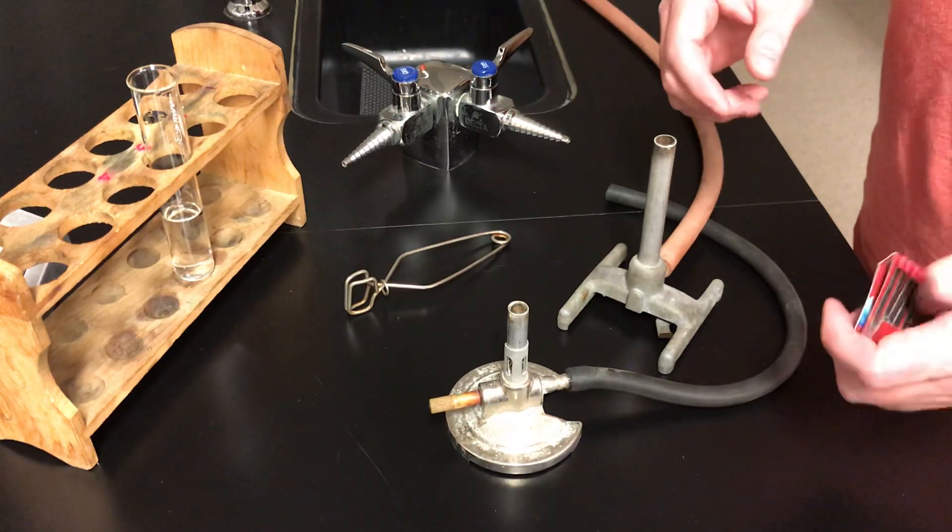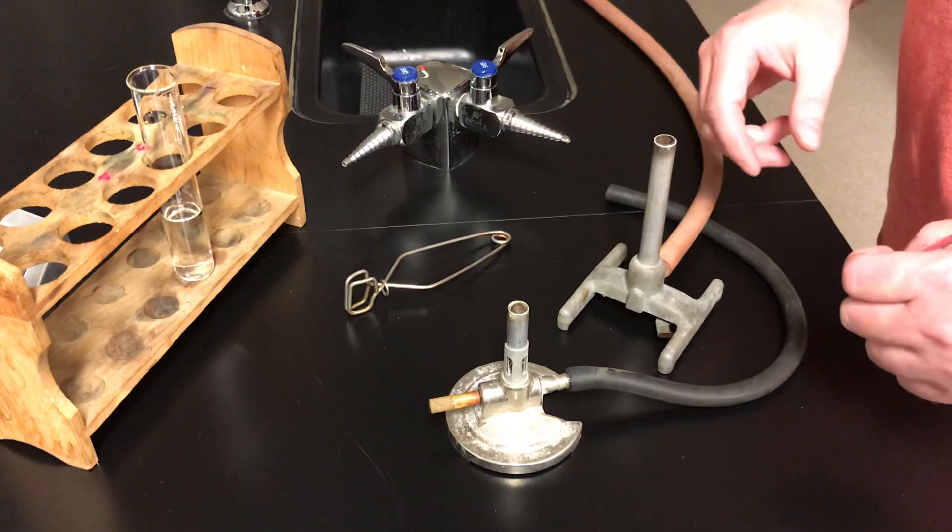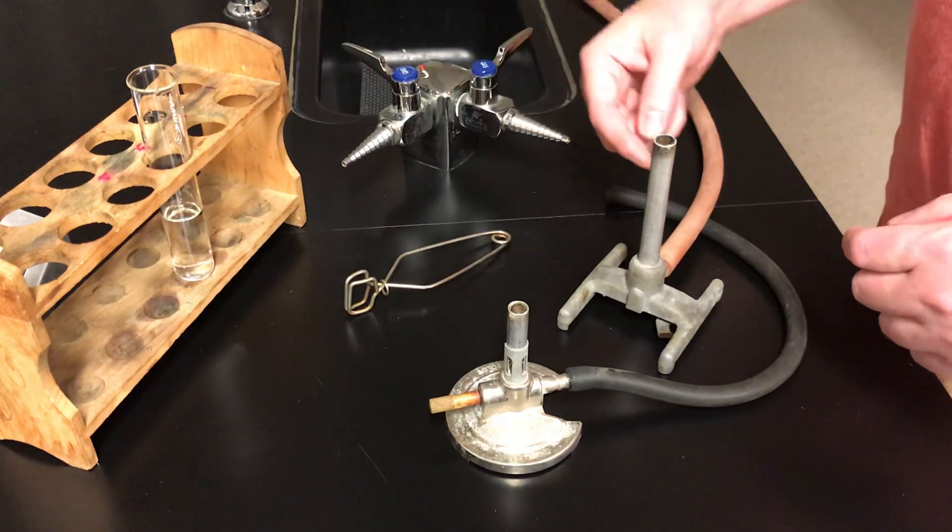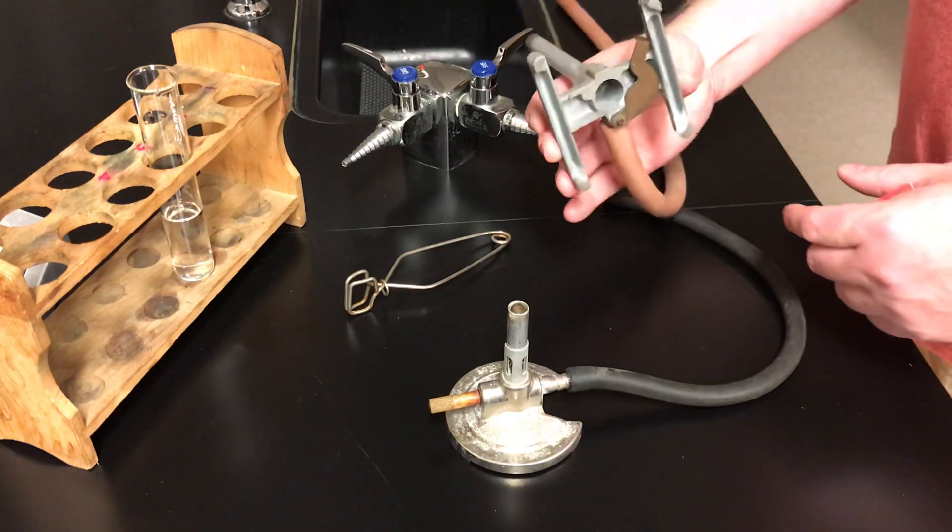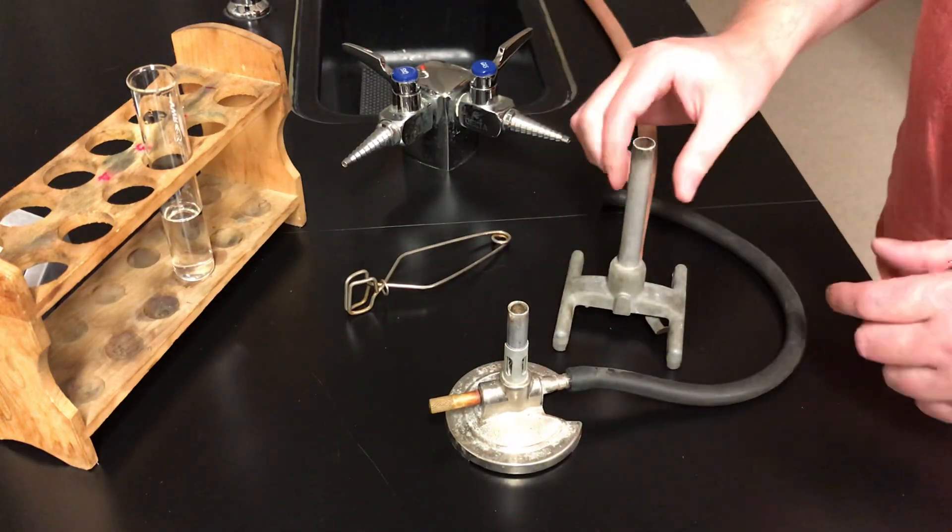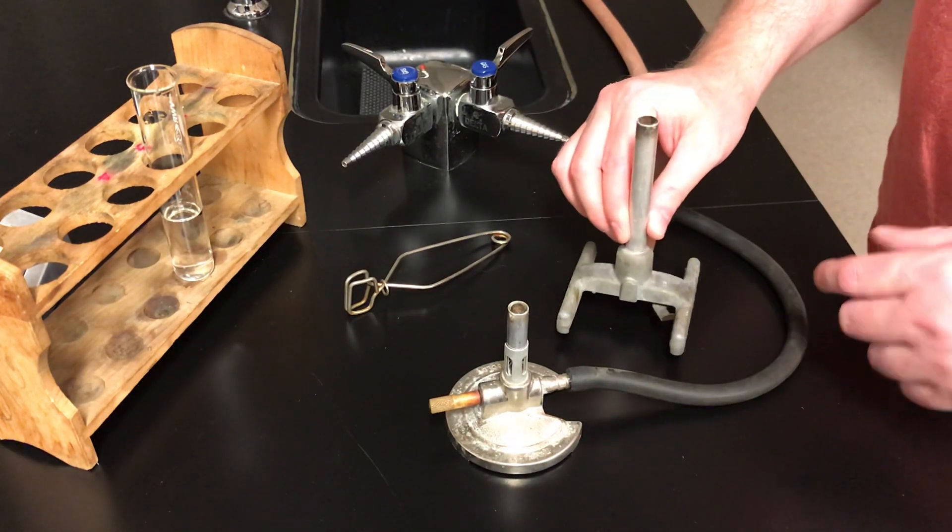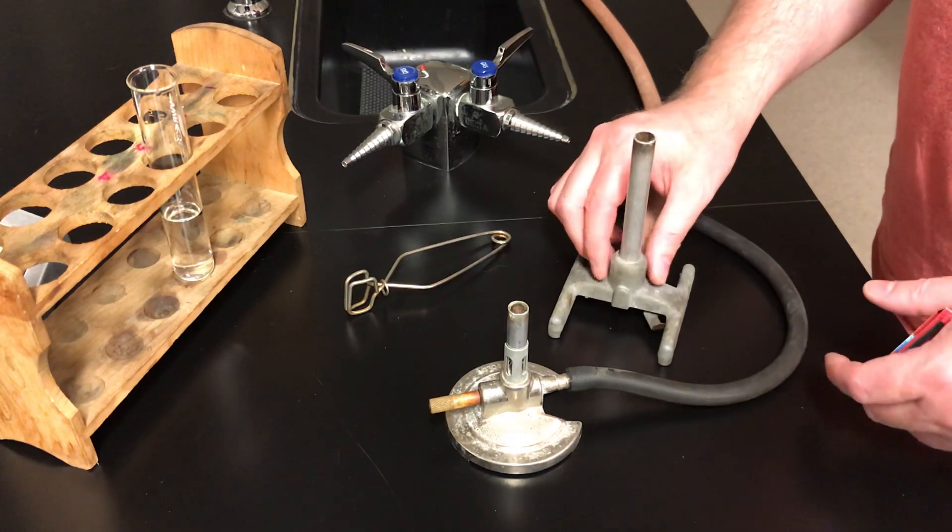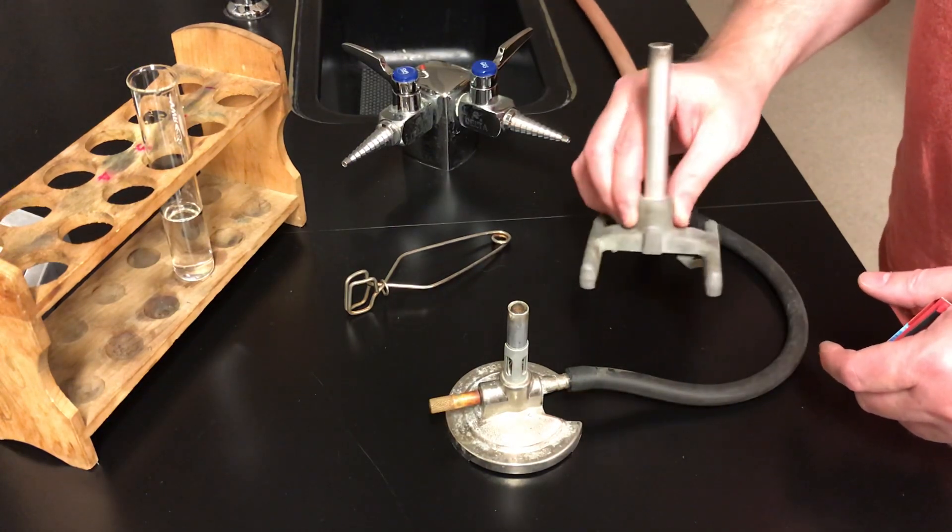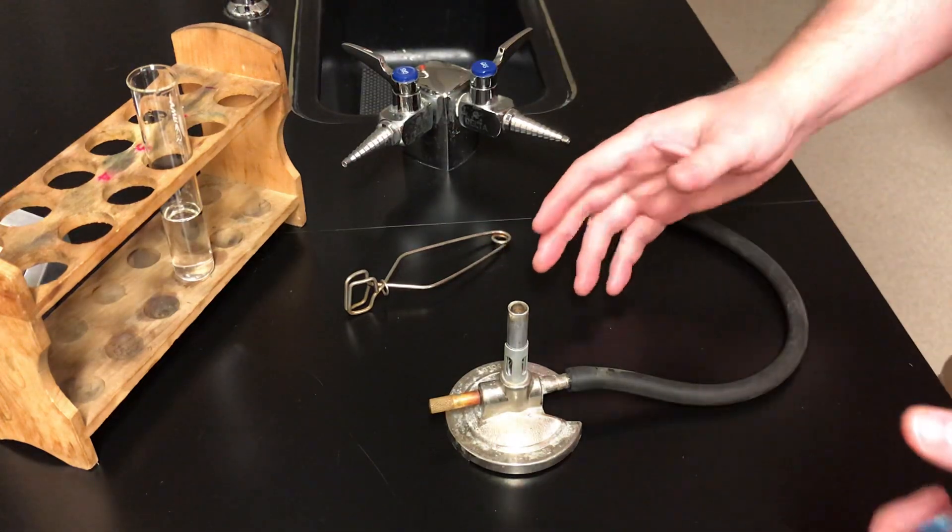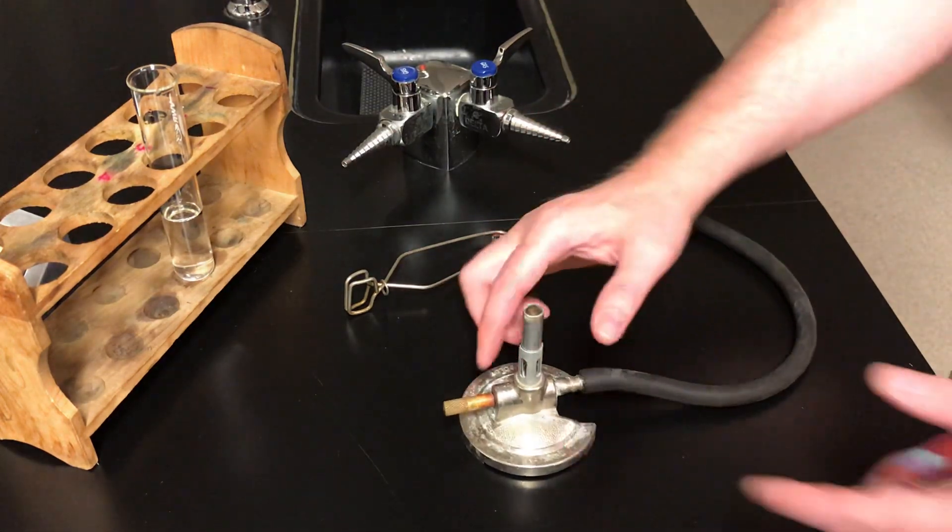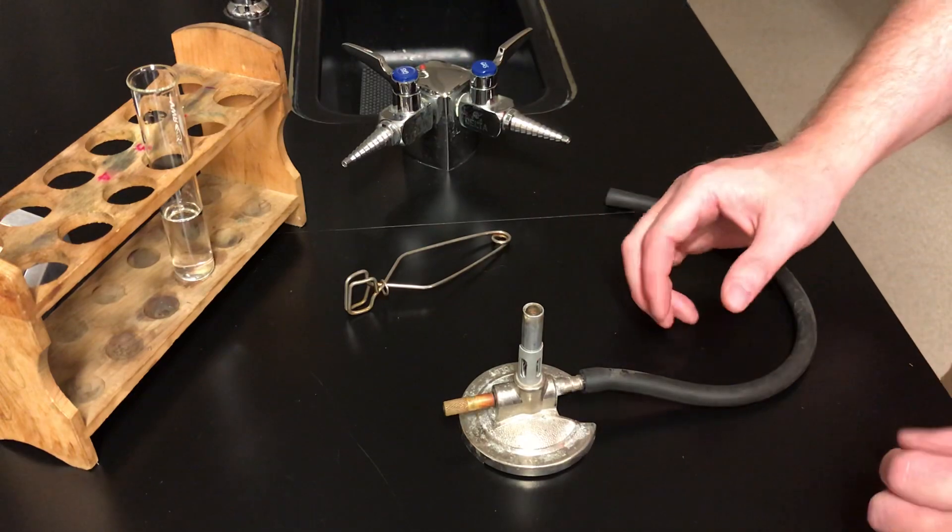When you look under the sinks in the lab at your lab station, you'll find two different types of burners. One type has this H-shaped base and is much larger. This is the Bunsen burner that we use in grades 10, 11, and 12. In grade 9 science, we don't use these ones, so we'll just put that aside. We're going to use what's called a micro burner. It's got a small round base on almost all of them.